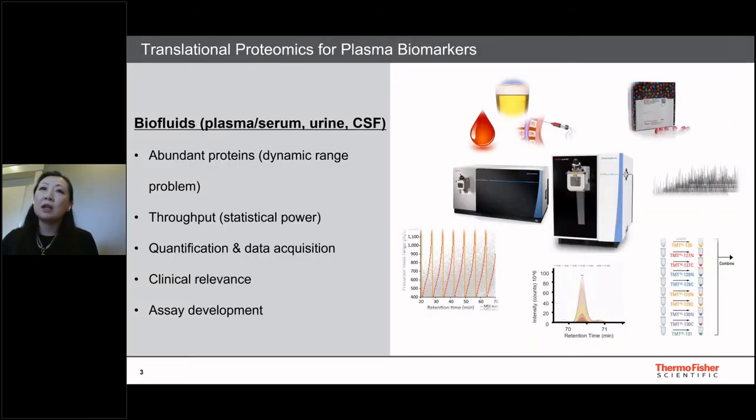Accessible biofluids are essential for monitoring human health and diseases. Proteomic characterization of blood plasma is very important for clinical proteomics and particularly for biomarker discovery studies. The vast dynamic range and high complexity of the plasma proteome, however, have proven to be serious challenges and have often led to a trade-off between depth of coverage and sample throughput to obtain reproducibly quantifiable results.